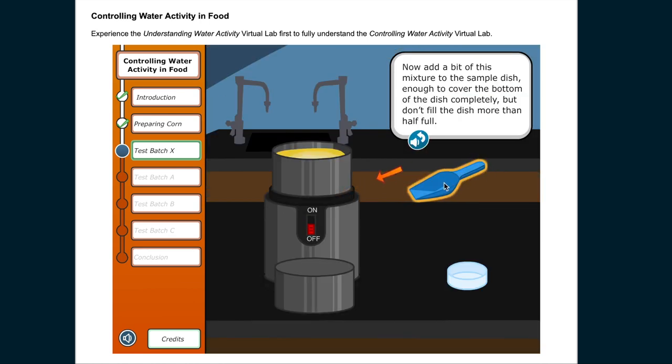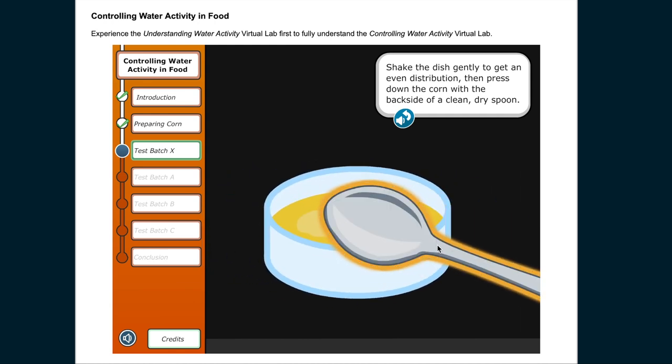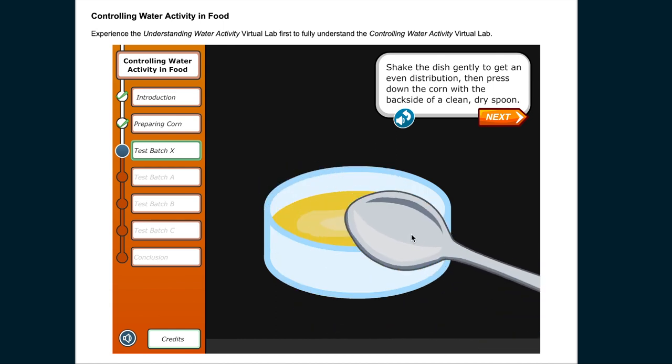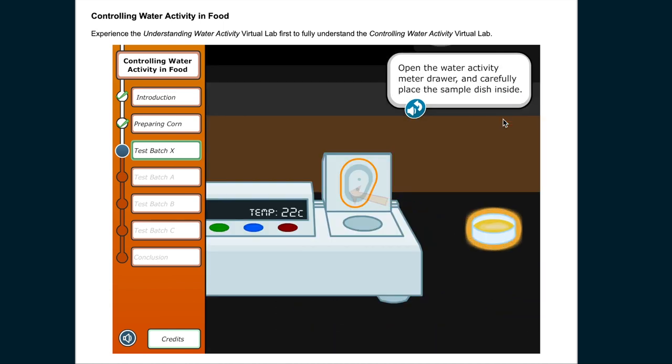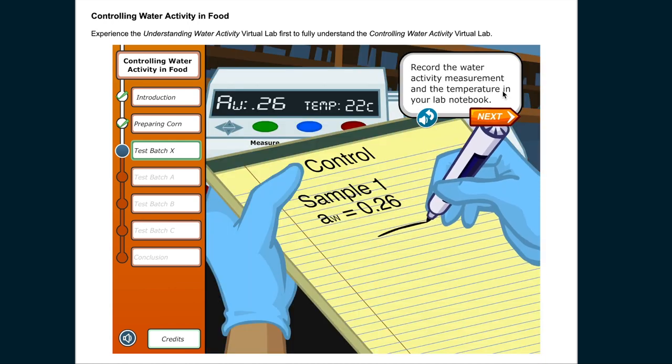Now add a bit of this mixture to the sample dish, enough to cover the bottom of the dish completely, but don't fill the dish more than half full. Shake the dish gently to get an even distribution. Then, press down the corn with the backside of a clean, dry spoon. Open the water activity meter drawer and carefully place the sample dish inside. When the meter beeps, the measurement is complete. Record the water activity measurement and the temperature in your lab notebook.